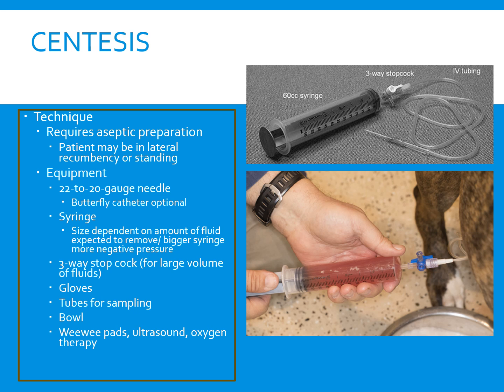The direction of the stopcock: if you look at the above picture, the stopcock is facing towards the tubing. So right now it's open, meaning that if you pull, the fluid is going to come into the syringe. And if you turn it towards the other side of the tubing, then you would push the fluid out into an exterior source like a bowl.